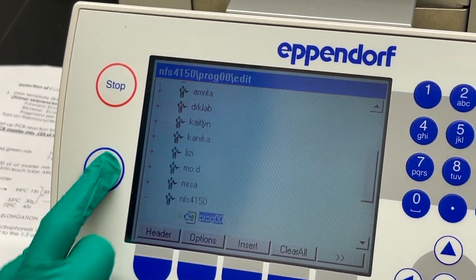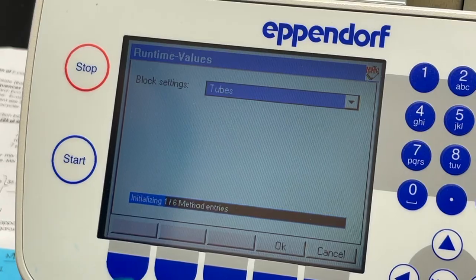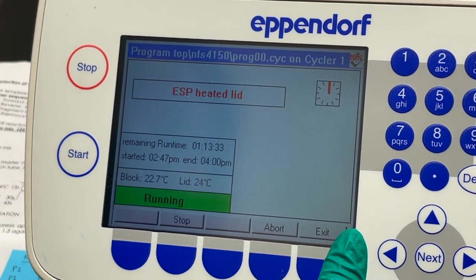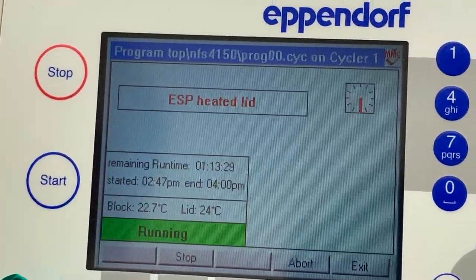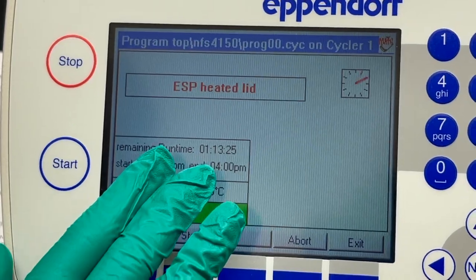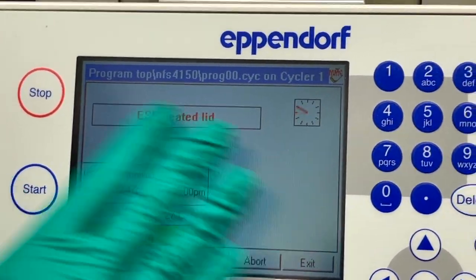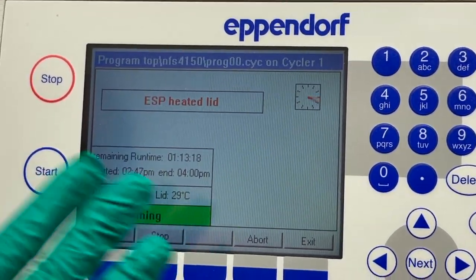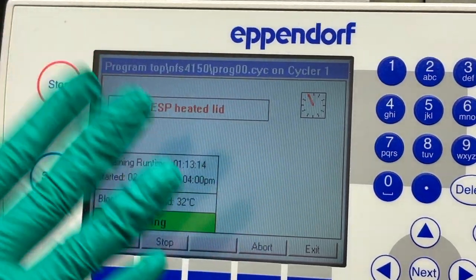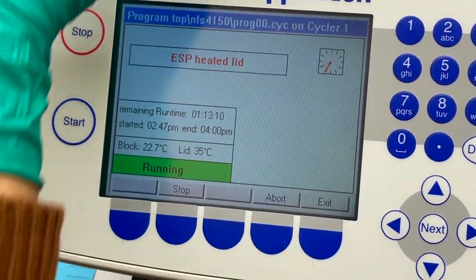Now I'm going to start the machine. It takes some time to initialize. The machine is running and shows a remaining time of 1 hour and 13 minutes. The lid will be heated first, and then the reaction will begin. We will wait for the reaction to complete and then collect our samples.